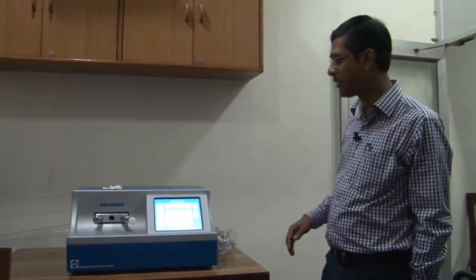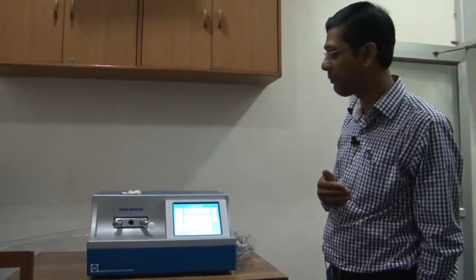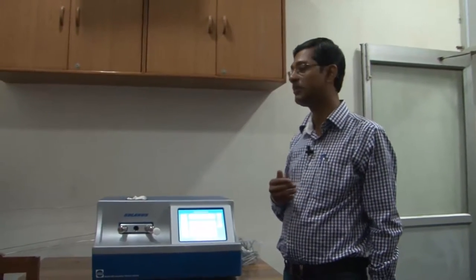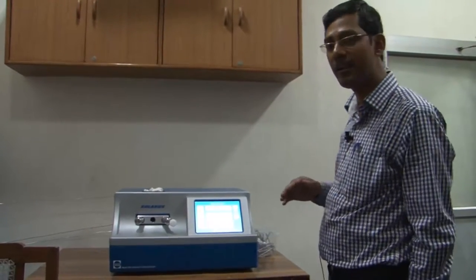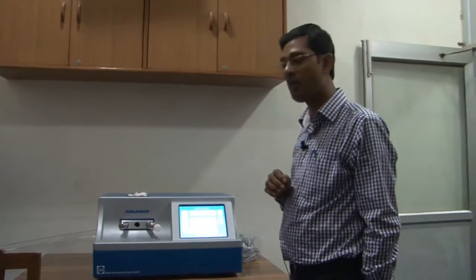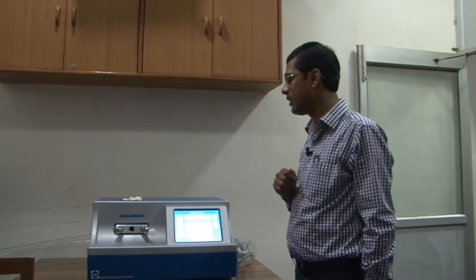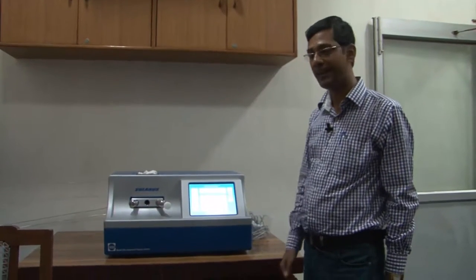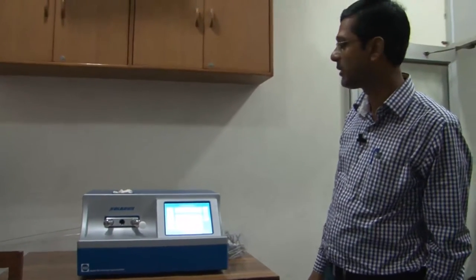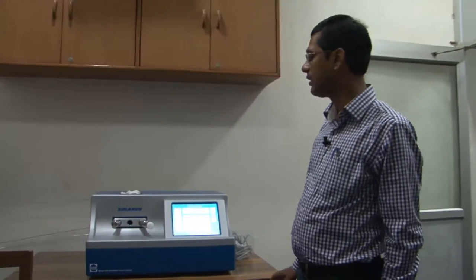In fact, many people nowadays use something known as a nano mill, where even after the normal thinning, the sample is cleaned using very low energy argon beams, very precisely, so the surface oxide layers are removed in a very controlled manner and we can get an actual high resolution image in the microscope. Following that, this machine can remove all further contamination, but a nano mill is very expensive, very few people in this world can buy it, so we don't have one. So many people in this world actually use the plasma cleaner to clean the sample.